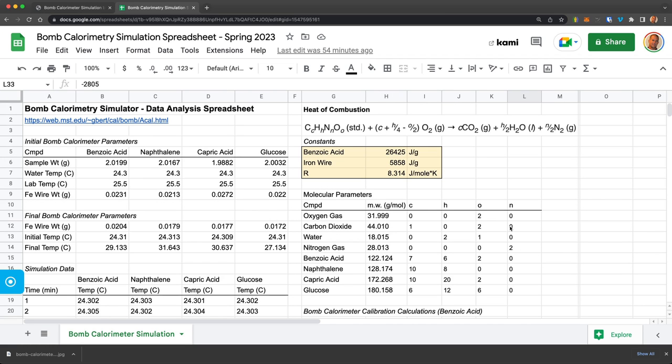And I hope this spreadsheet shows you how you would take that simulated data and put it into a spreadsheet that is almost indistinguishable from what you would do if you did this as an on-ground, in-lab experiment.